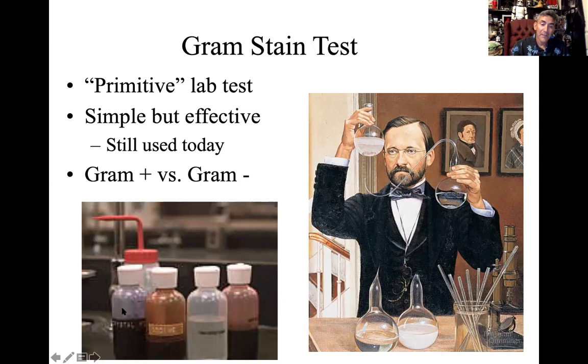So the violet stain and the red stain are just stains. They're just different types of purple or red stain to give a little bit of color so we can see boundaries, we can see edges, so light is not just passing right through these little bacterial cells. We get some contrast with these stains.